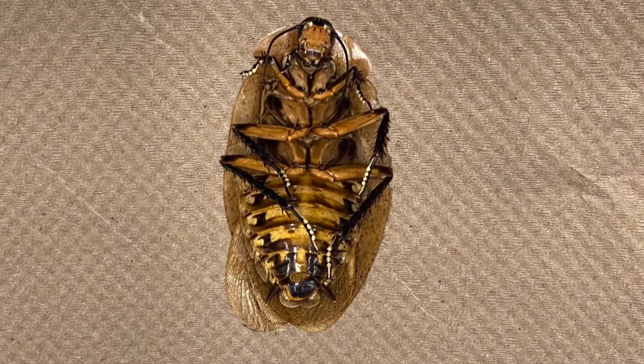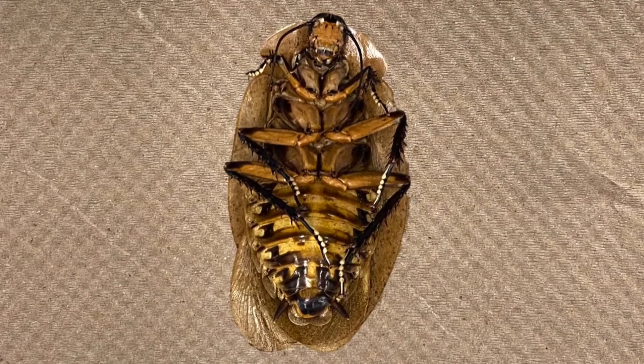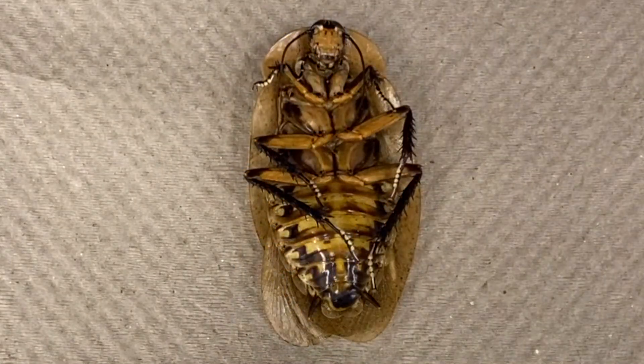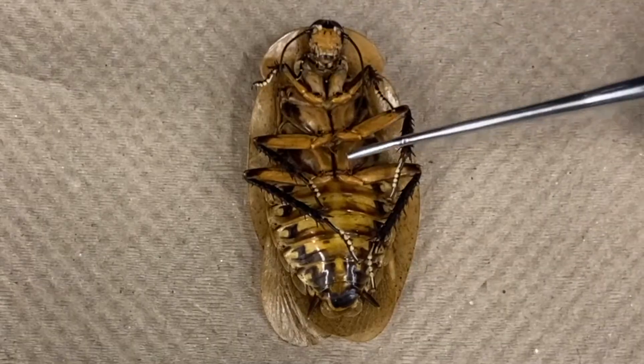The cockroach being used in this video is the peppered cockroach, Archimandrita tessellata. We will start by examining some features of the external anatomy. The cockroach is divided into three distinct body parts: the head, thorax, and abdomen.